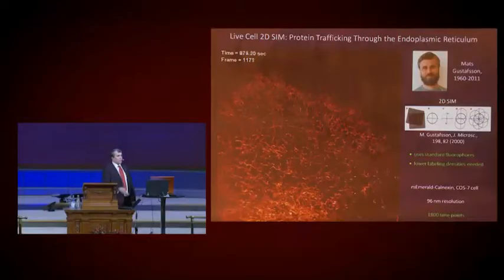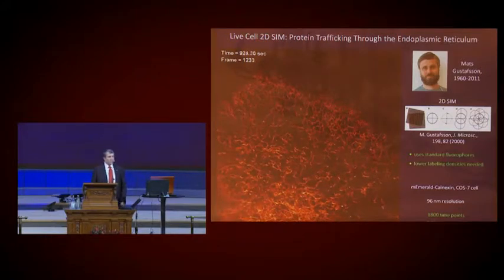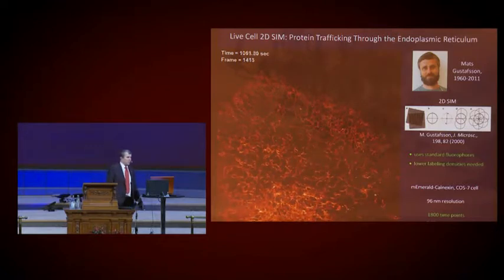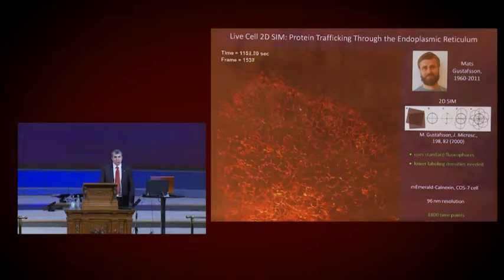One of the reasons that technique has not gotten the attention it deserves is that everybody says, oh well, if STED and PALM can do 10 times, what's the big deal about 2 times? Well, the big deal is that it's much faster and uses much lower intensities, and Mats appreciated that.